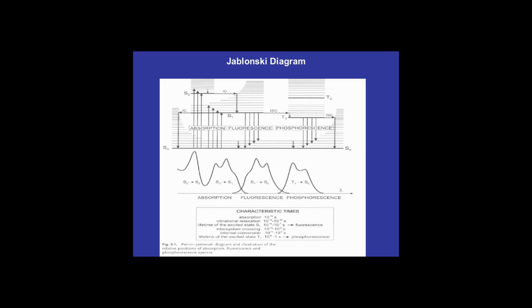I_i is the recorded signal in the i-th channel and k is the number of channels. The lifetime can be estimated using tau equals delta t divided by the natural log of d_0 over d_1.